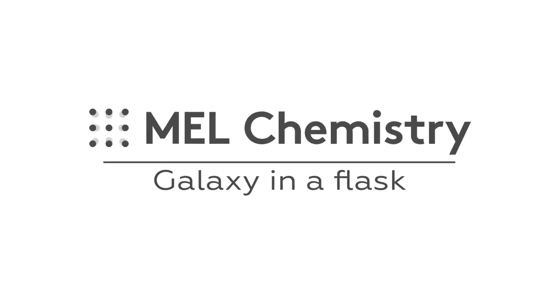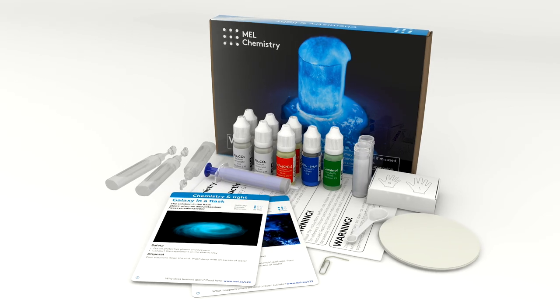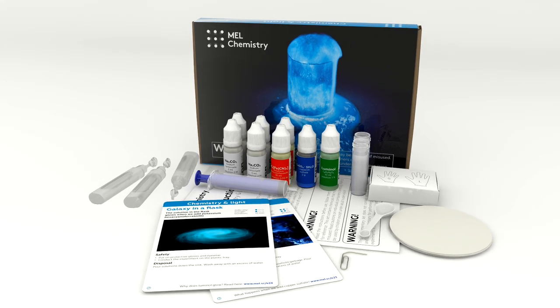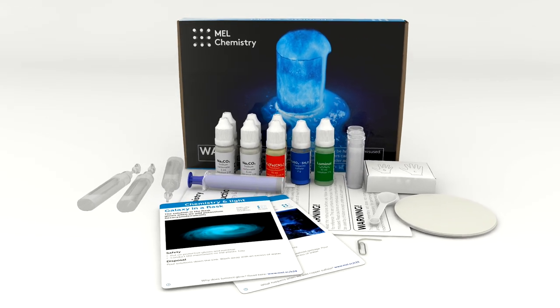Welcome to the wonderful world of chemistry. Today, with the help of the chemistry and light set by MEL Chemistry, we learn how to make a galaxy in a flask.